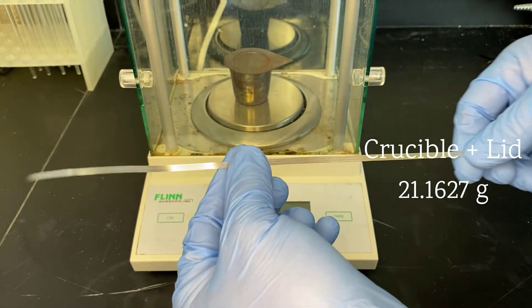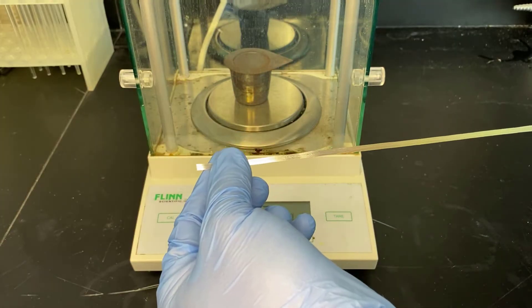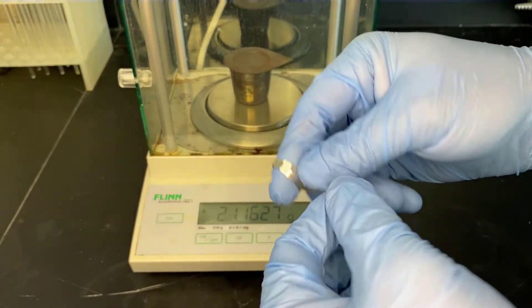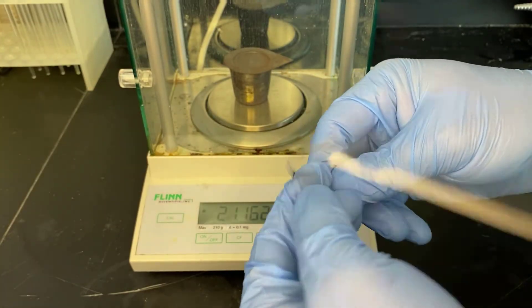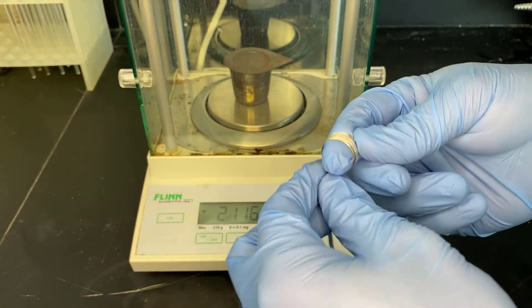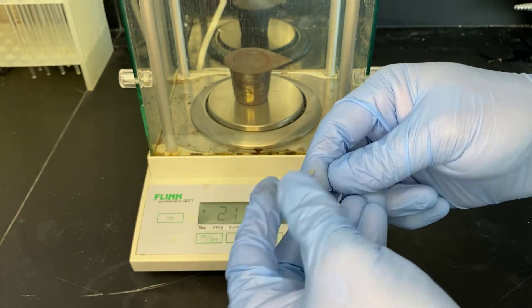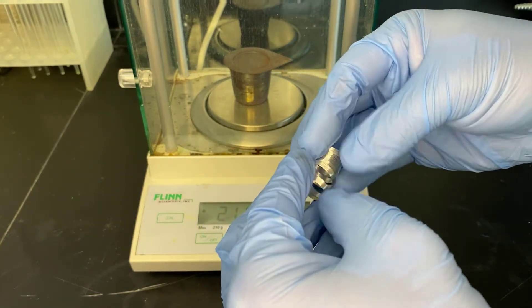we're going to produce magnesium oxide, and that magnesium oxide is going to be light and airy and capable of going everywhere. It's going to be so light and airy that with the amount of heat around it, it may eject right from the crucible with any little crack.